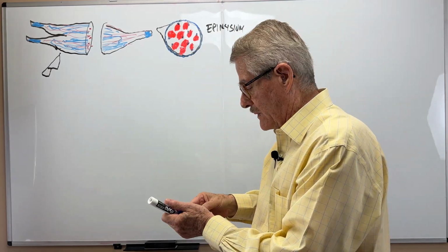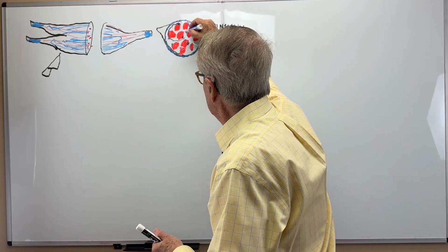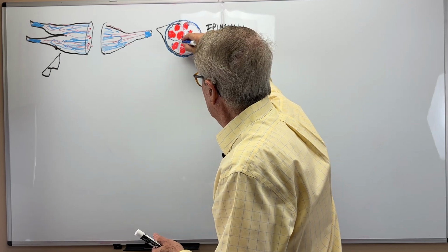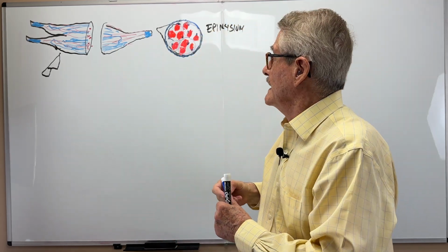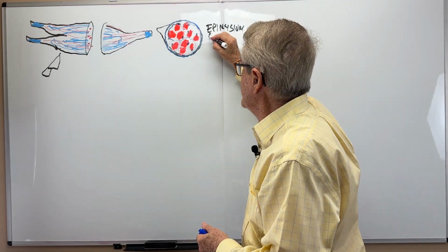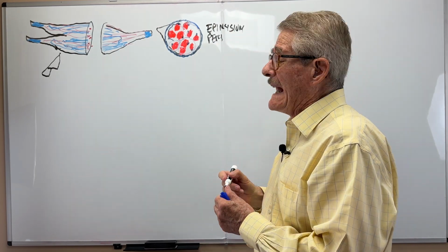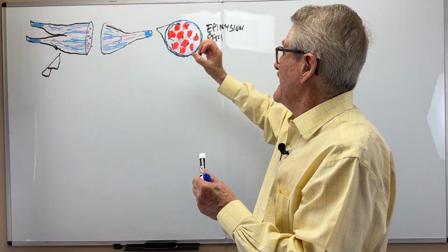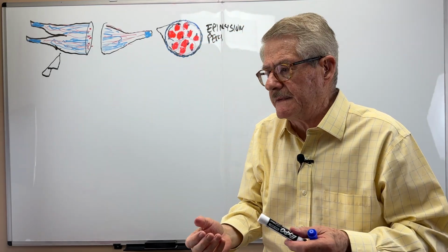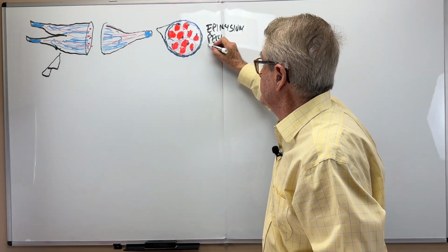It will also have different groups of fibers surrounded by a layer of connective tissue, which is called the perimysium. And around each individual fiber, there is also connective tissue that is going to be called the endomysium.